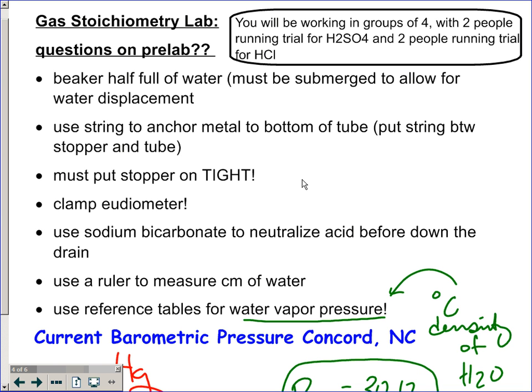All right guys, I have some folks who are getting ready to start. Listen, Wells 2, you need to neutralize your acidified water. There's baking soda over here. I would bring yourself a beaker and scoop some and bring it back to your station. After you get all your measurements, you can then begin the next section.